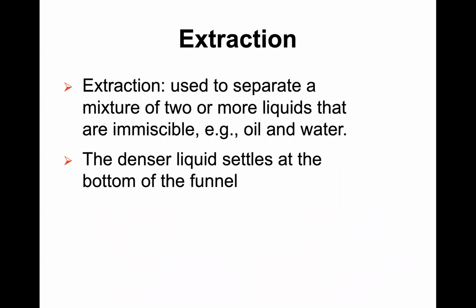Now let's look at extraction. Extraction is another process often used in the laboratory, particularly in the organic lab. Extraction is used to separate a mixture of two or more liquids that are immiscible. So for example, use the oil and the water. For example, here we will have a separating funnel, something like this.